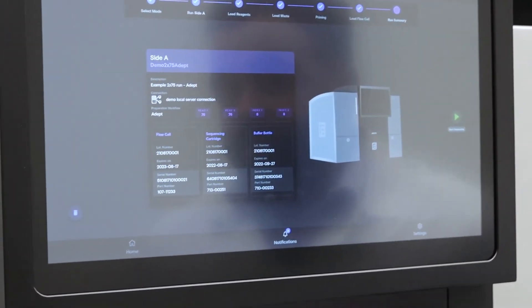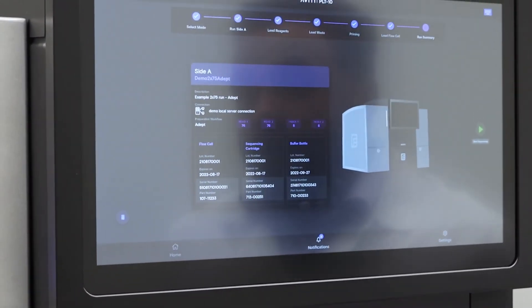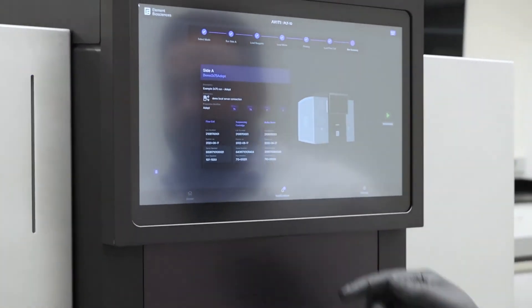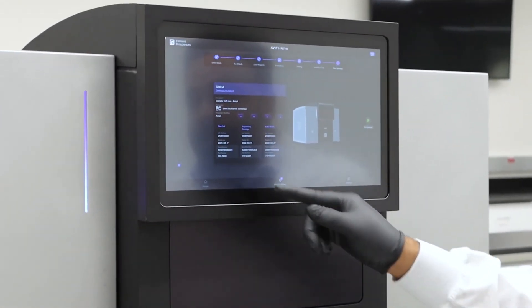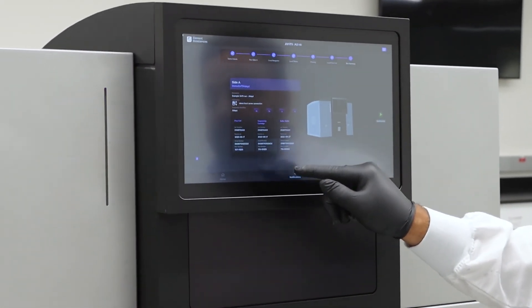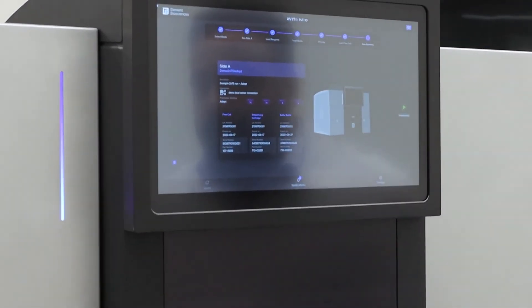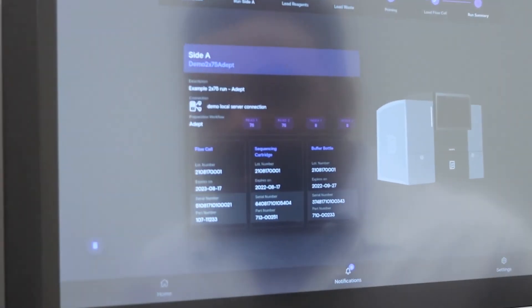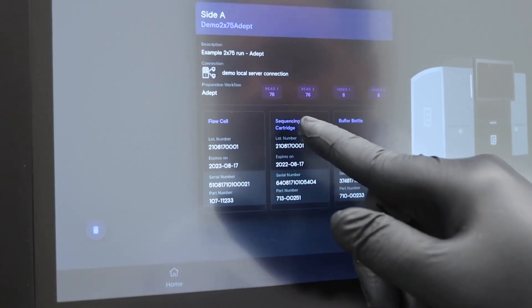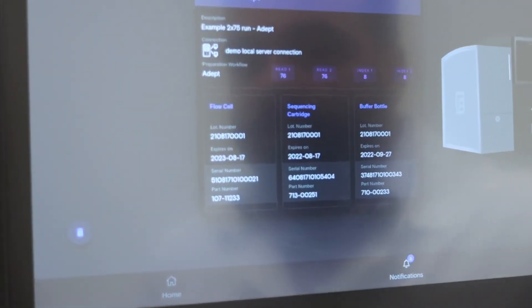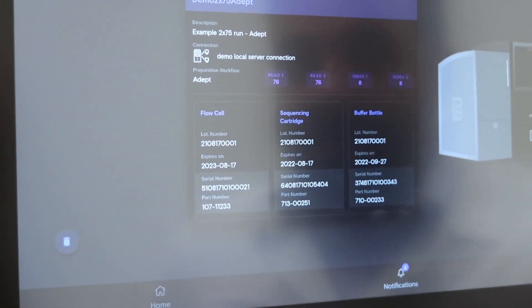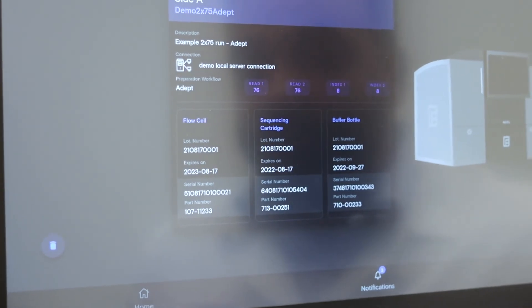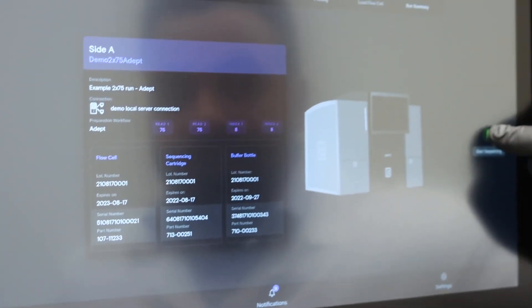This next step is just for you to confirm that everything you've wanted set up is set up correctly. So you'll be presented with the run description, cycle conditioning, as well as the adept or elevate library workflow selected. You'll be able to see your flow cell, sequencing cartridge, and buffer bottle lot number, expiration date, and serial number. Once you're happy with how everything looks, you would then start your sequencing run.